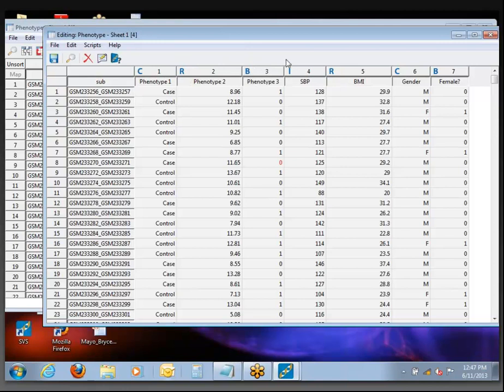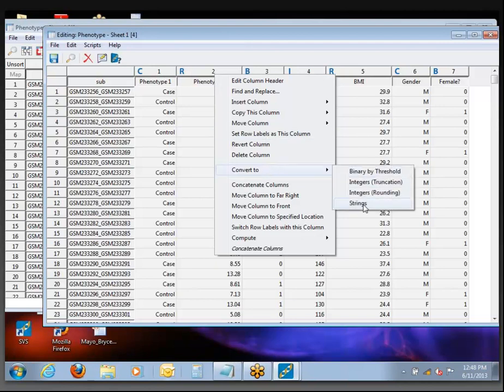It's important when you enter a new dataset that all columns are formatted with the expected data type, because they're all handled differently in analysis and have different options associated with them. For example, if when you import your data there's some random cell in a numeric column that has a bit of text, or an unusual character like a dollar sign or percent sign, that might force the entire column into a categorical type — which is how we classify any text strings. If you need to fix that, come to the editor, fix that particular cell, and then convert it into a numeric data type.